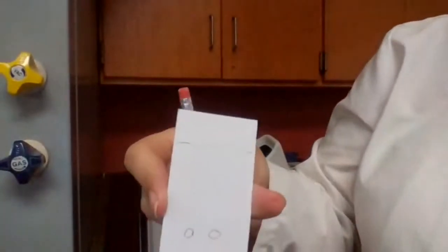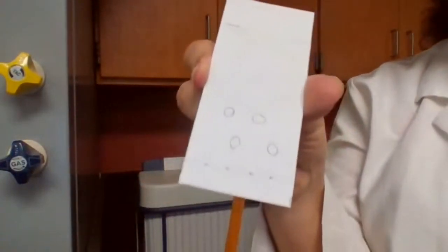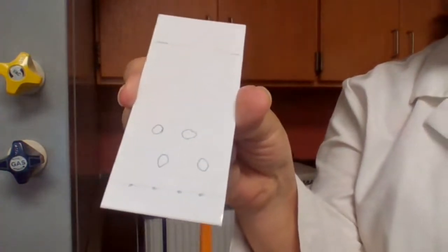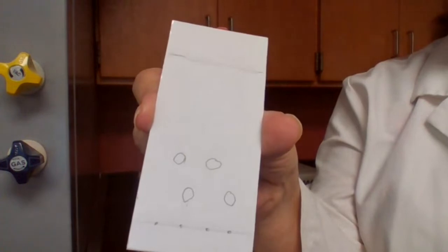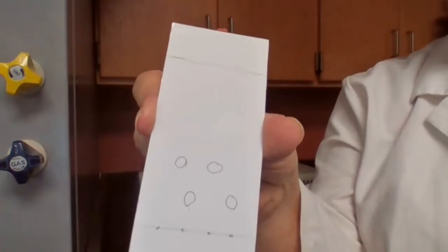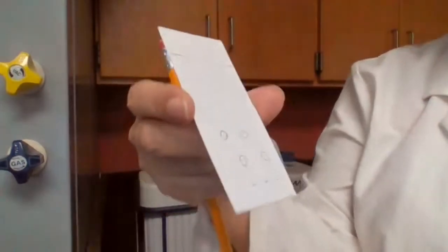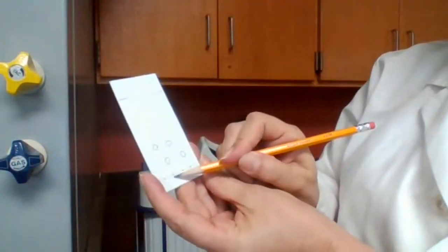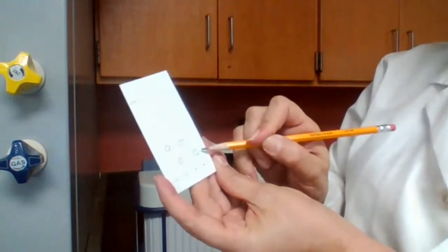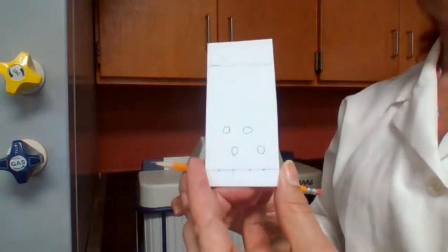I have the spots. Can you tell me my unknown is which compound based on what you see here? My unknown is going to be acetaminophen because the second mark here was acetaminophen and the unknown moved up at the same distance as the acetaminophen.